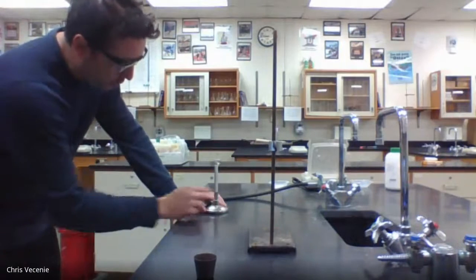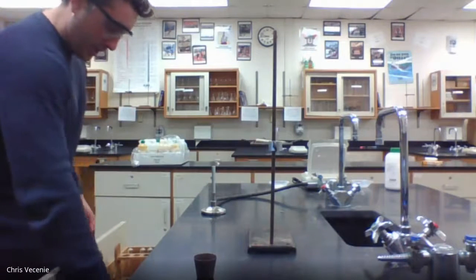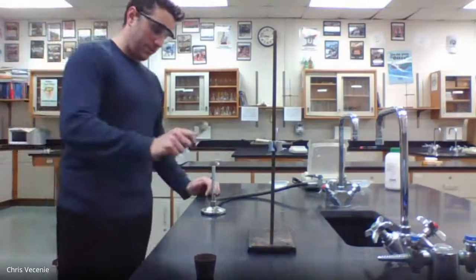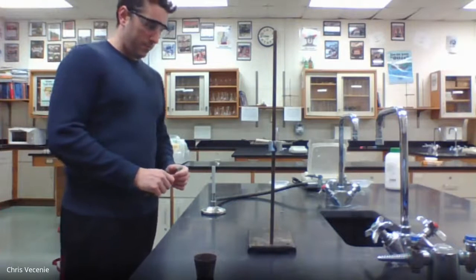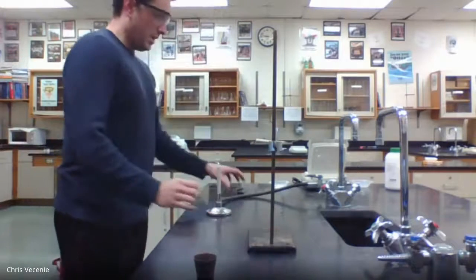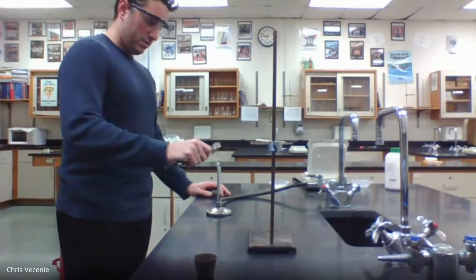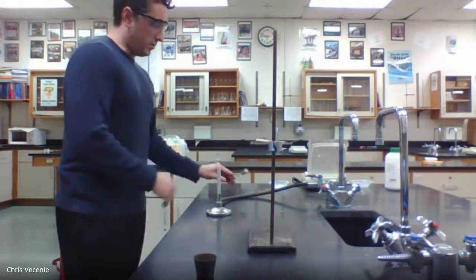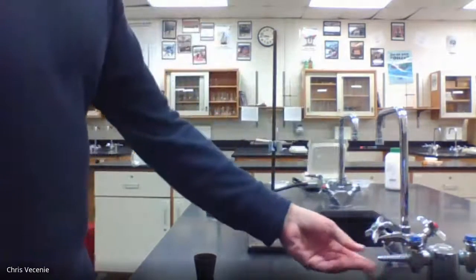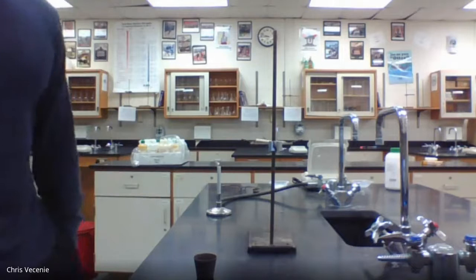Right, with your Bunsen burner, close the windows so all the gas will go straight up to the top of the burner. Go in here. Get out your striker. Right, turn your gas on. Okay, it's been a while since we used the gas. I might be flushing some oxygen out. All right, so we'll give that a second. Turn on some valves. In the meantime, I'm waiting to flush out a little bit of air in the gas lines there.